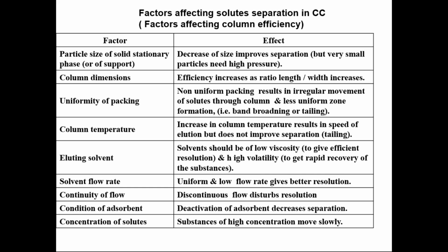Here, the effect has only been summarized, but in HPLC, the details will be discussed. So, particle size. Just like TLC, as the particle size decreases, the resolution increases.